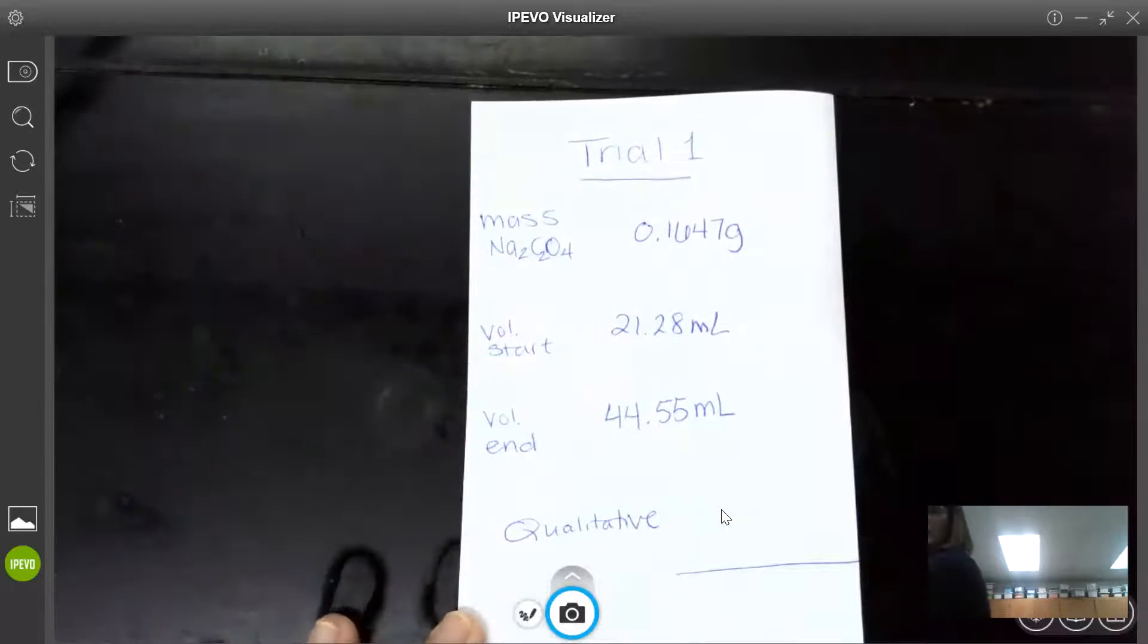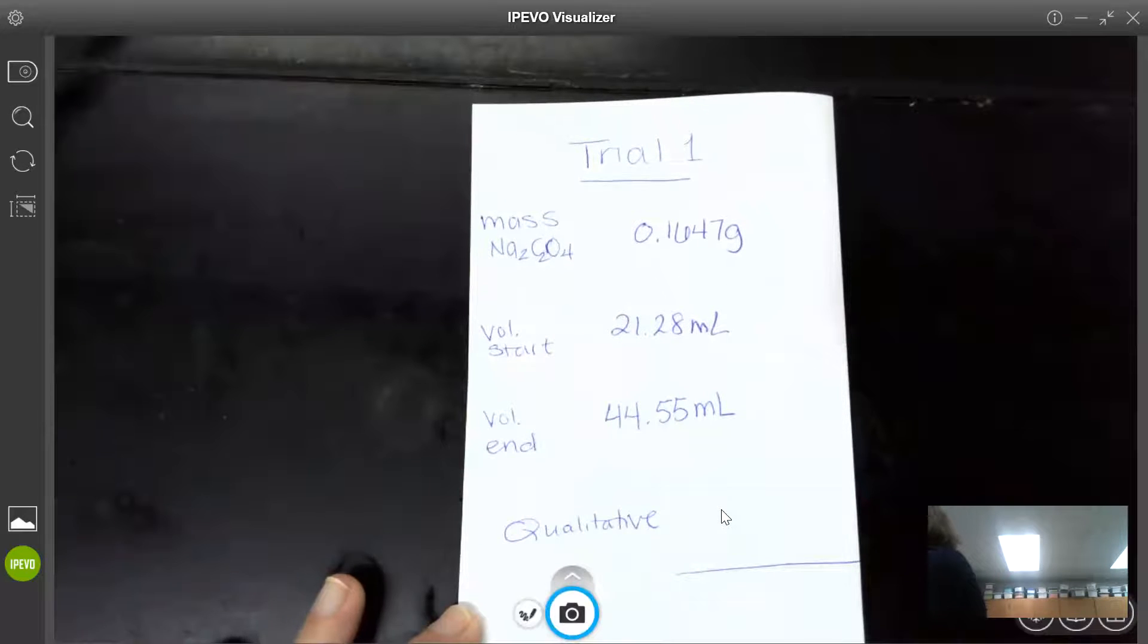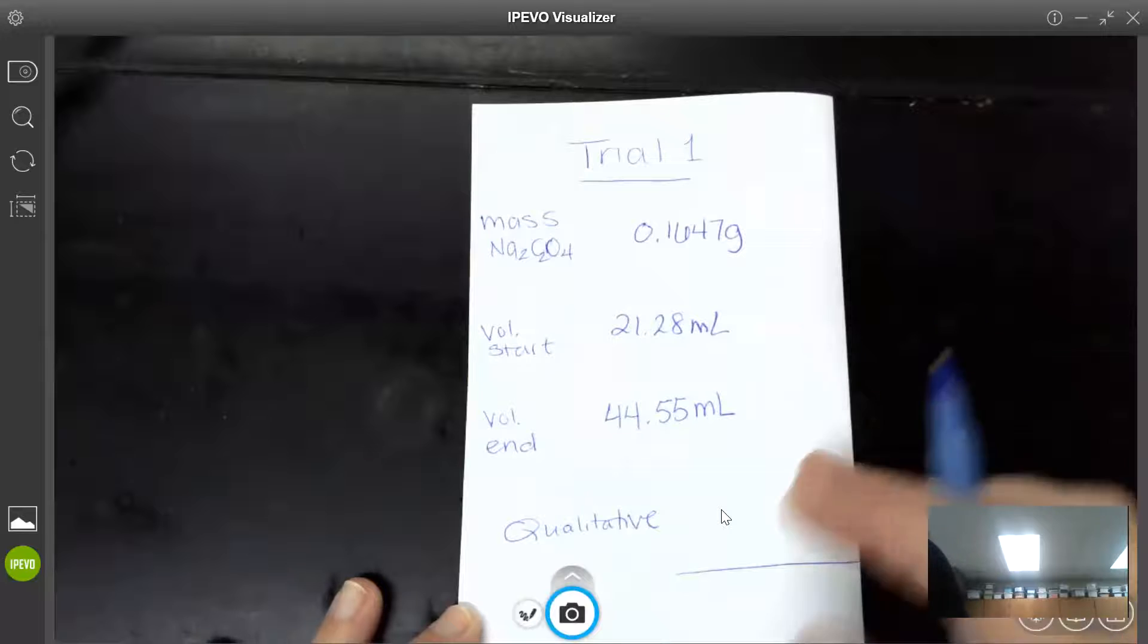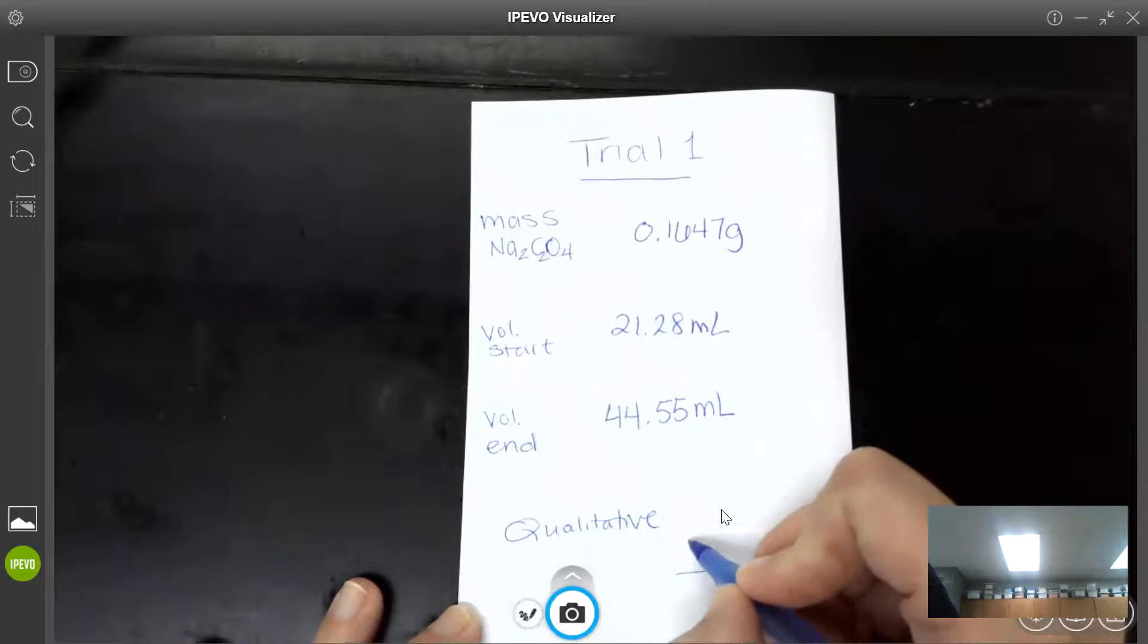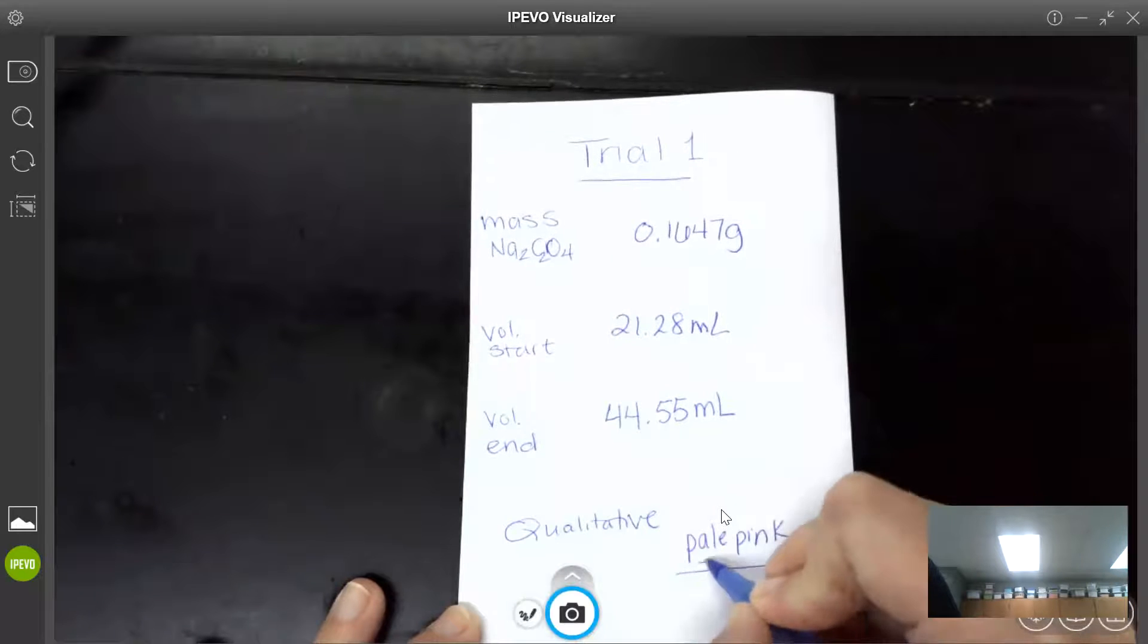Whenever you do a titration, it's important to include qualitative data for each trial that you do. So in this case, my qualitative data is going to be that the resulting solution is pale pink at the end point.